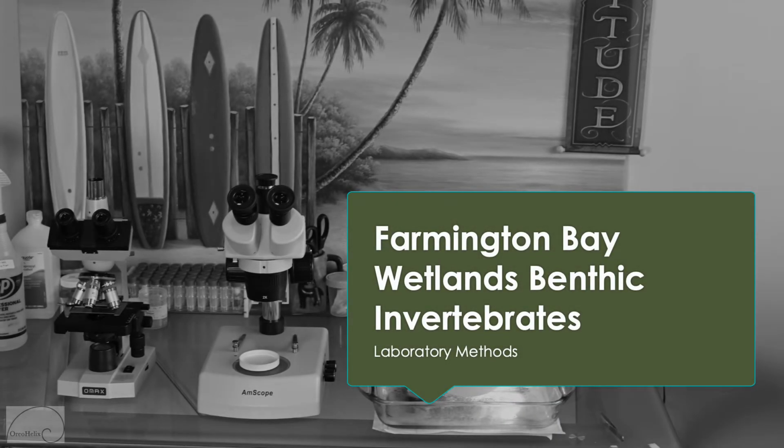In this presentation, we will discuss the benthic invertebrate lab methods used in our Farmington Bay wetlands research in 2020. Research was conducted by Oreohelix Ecological and members of the Wasatch Front Water Quality Council.